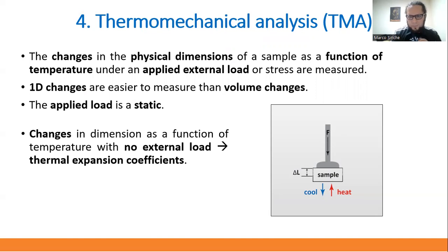As we could see in the picture, a load, which is an external force, is applied on the sample, and the change in the vertical length of the material could be measured both with heating conditions or cooling conditions in order to understand a little bit better these properties of the material.